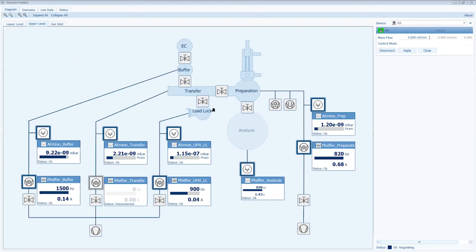Okay, one question. Is this LabVIEW, or is it within the program, the software that you sent us to download? It's provided by a company, by Specs. Oh, so it's Specs LabVIEW, I think, because it reminds me. Maybe it looks like LabVIEW, but it's like an analog, a similar program. But you cannot program here. I mean, we never tried. I have some experience with LabVIEW, but here.